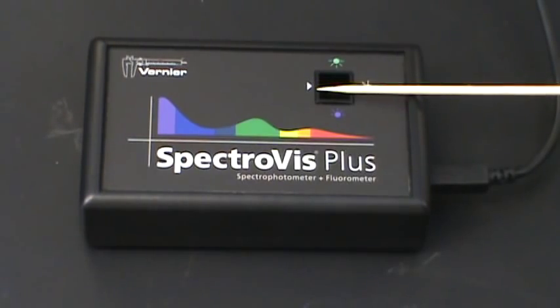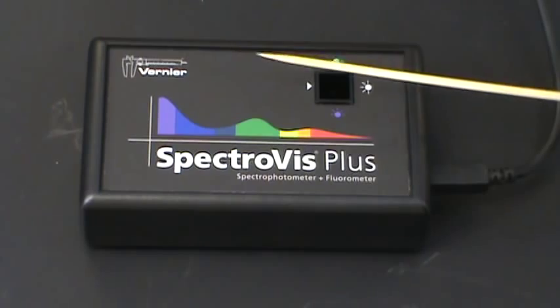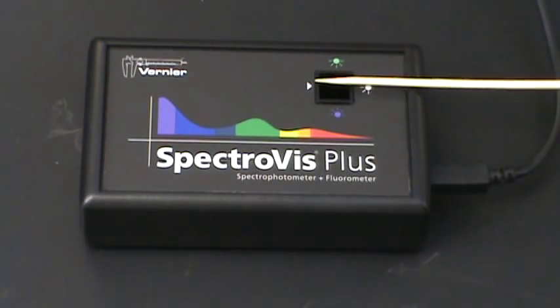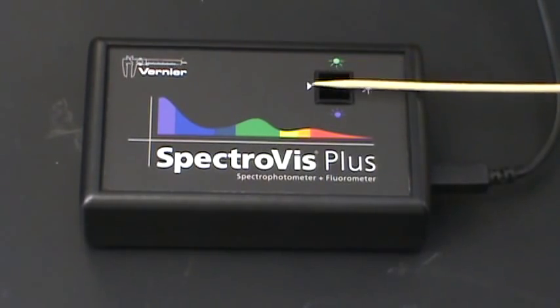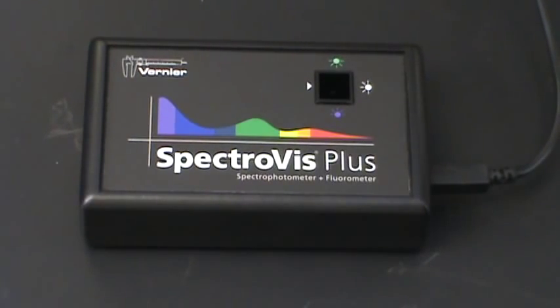The triangle is the side where the detector is. So whatever light we pass through our sample is going to go through our sample and into the detector. So this is where all of the actual work happens. After the light comes through, the detector is going to process things and figure out what we've got.